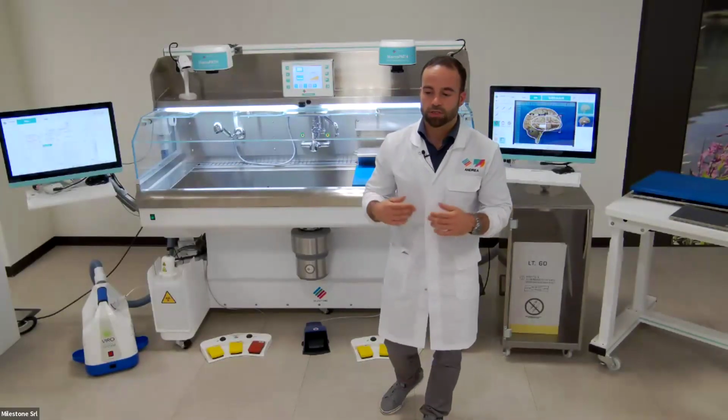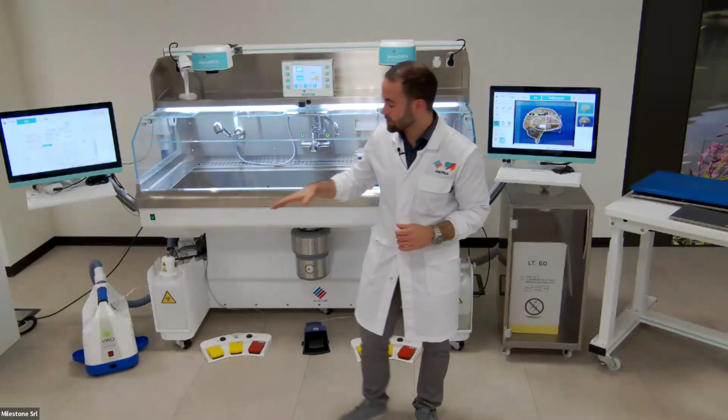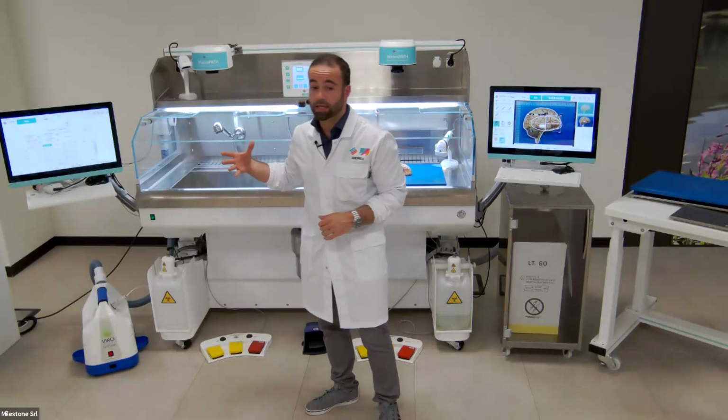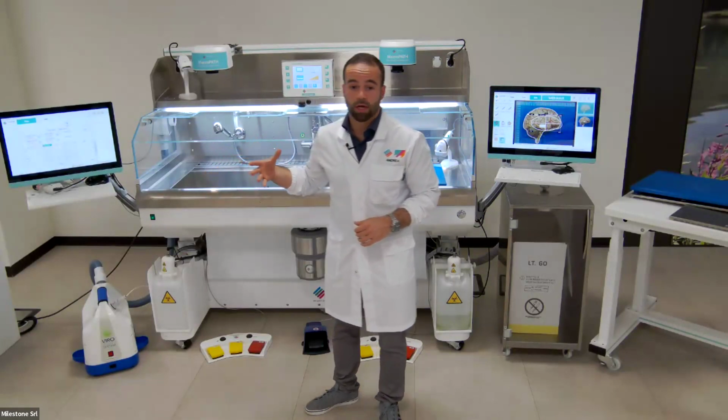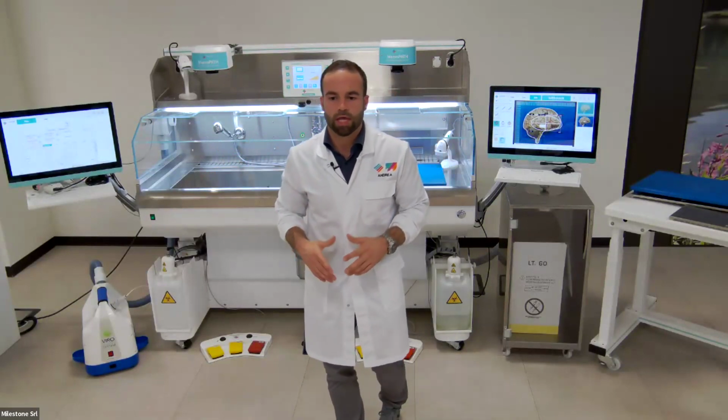Okay. Let's move on again. Another question is the following. You mentioned a fast cleaning system. Can you tell us how much time you need for the cleaning? Yes, just a few seconds, because it's really, really fast. This particular tool nebulizes a dry fog inside the working area and takes up to 30 seconds.